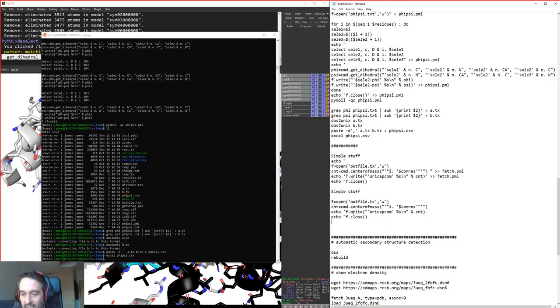And it should be similar to this here, where you open up an out file, you have some kind of command here where, for example, you're measuring the center of mass, or instead of center of mass here, you could replace this with distance or whatever you want, and then you have your selection within that section, and you have a variable that command and selection refers to, and then you can just simply write that out like this into that out file, and then you just close it at the end, and that writes the file for you, and that way you can save any data that you were creating.